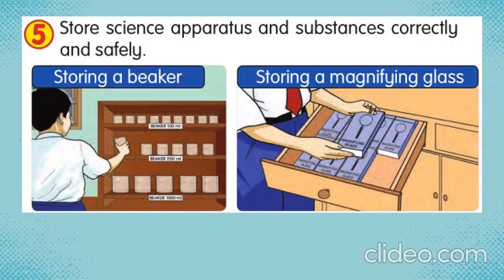Number 5: store science apparatus and substances correctly and safely. Usually, students, there will be a big rack with labels in the science lab, so you will store all the apparatus according to the label. You should put back the apparatus from where you took it from. For example, storing a beaker and storing a magnifying glass.